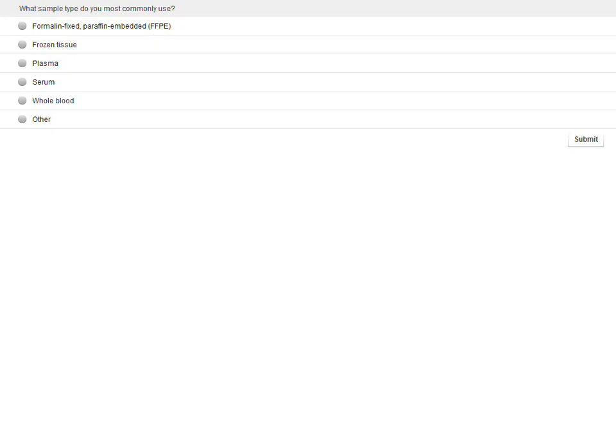So Dr. Shelton, just while the audience are voting, can you please tell us why you decided to ask this question in our session? The large number of people using ddPCR right now appear to be cancer researchers, and the variety of different kinds of sample types are of interest to us for the quality of DNA that can be expected, the inhibitors that might be present, and the variety of samples that people are using.